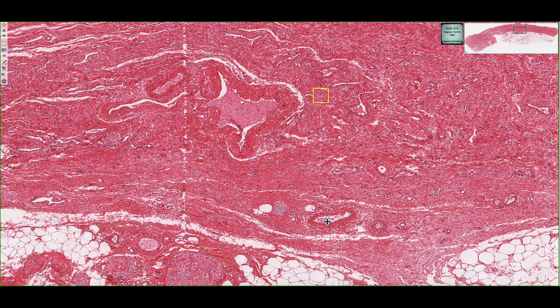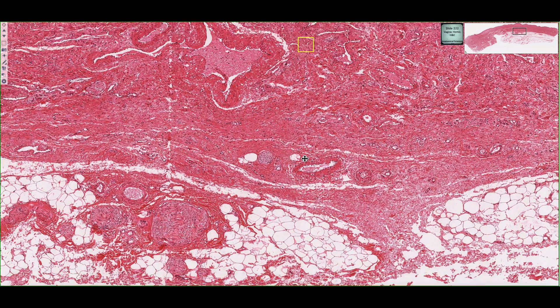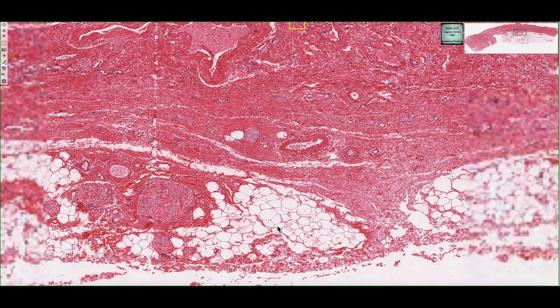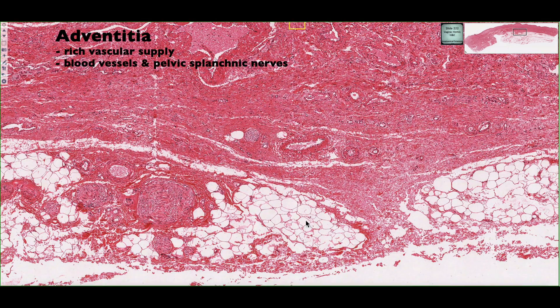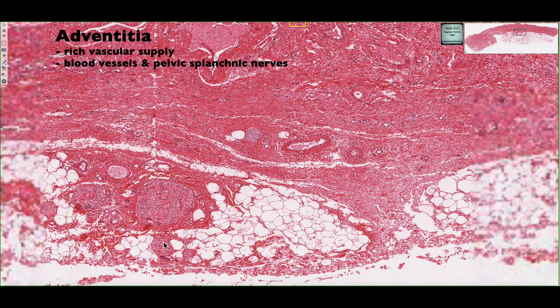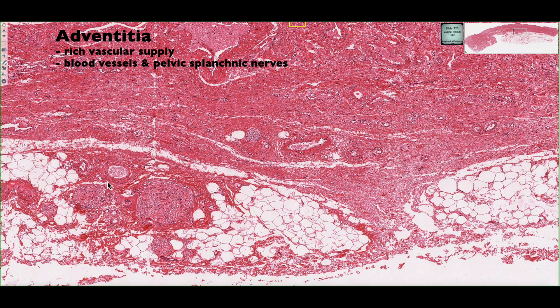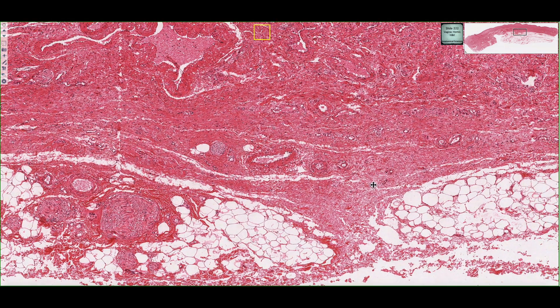The adventitia consists of adipose tissue, connective tissue, and here are some nerve fiber bundles that are found in the adventitia, as well as some blood vessels.